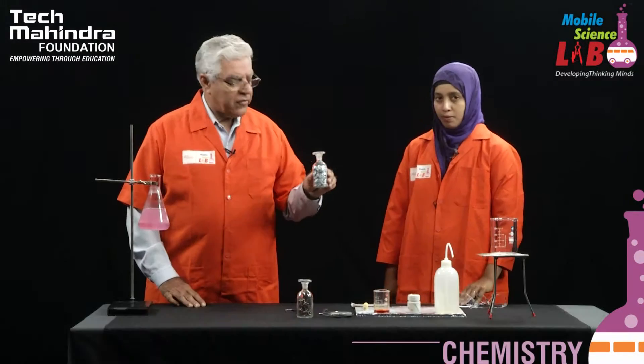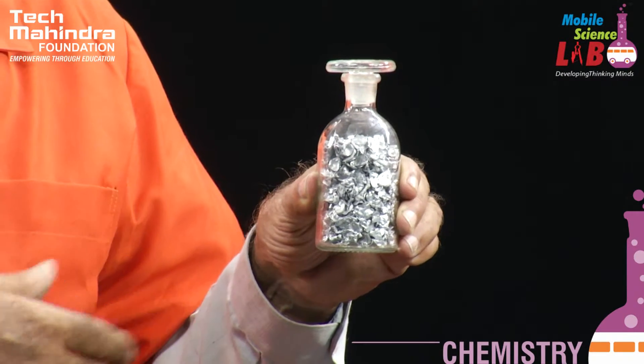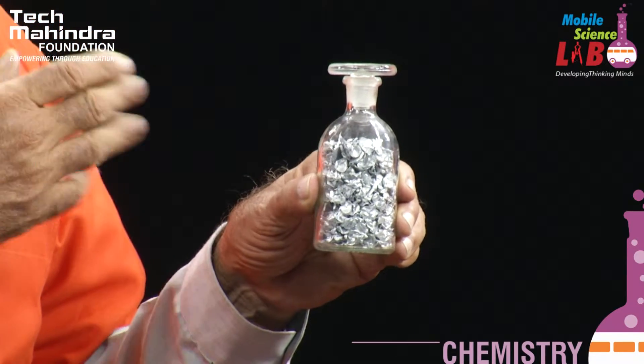In this bottle I have got some zinc granules. These are shiny grey material pieces — you can see zinc has got a shiny greyish-white lustre. Being shiny is one of the characteristic properties of metals.